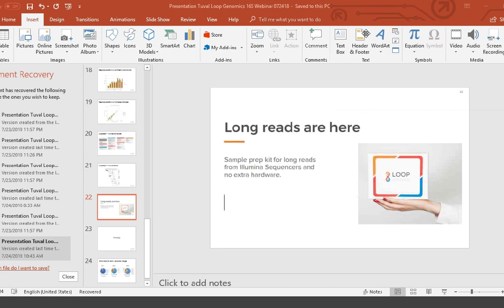I'd say the general answer to that would be that we think that there's room for both long-read 16S sequencing and long-read metagenomic sequencing. They're simply used for different purposes. Obviously, long-read 16S sequencing is more cost-effective in terms of sequencing cost. But with the shotgun metagenomics, you can access data that will be hard to access using 16S, even with 16S long-read sequencing. So let me defer the answer to that question to our shotgun metagenomics sequencing webinar.